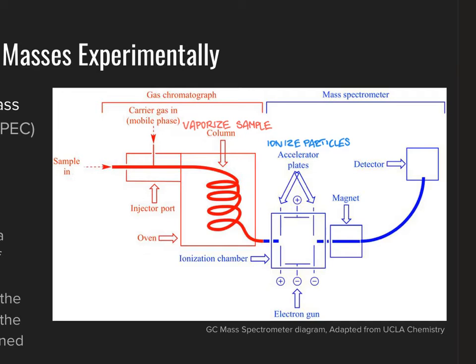Now, those positively charged gas phase ions are ejected from the chamber at speed and pass across a magnetic field. Recognize that if you've got a positively charged ion which is moving through space, what you have is a moving charged particle, and from your physics days, you recall from your laws of magnetism that moving charged particles generate themselves a magnetic field.